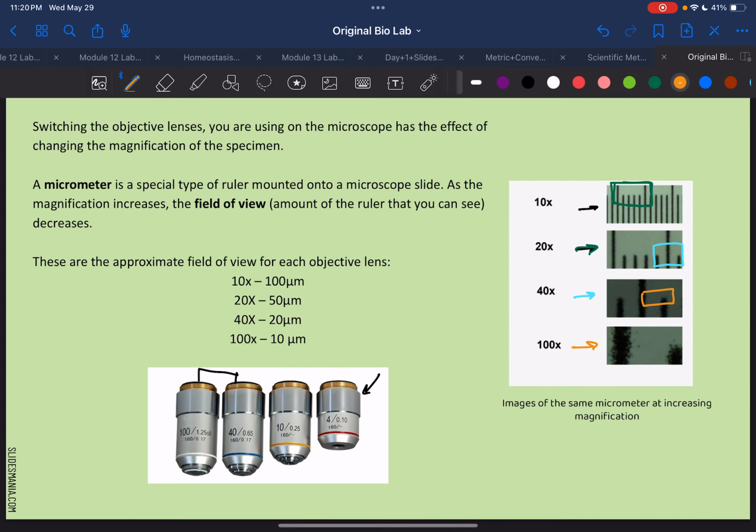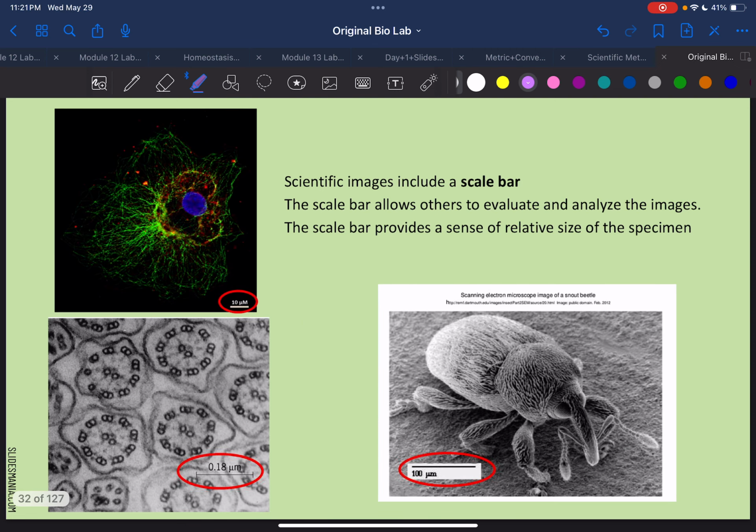Okay. The unit that we're going to be using for this one is micrometer. That is what it's called. A lot of the microscopes that we have in our actual lab classes have a tiny ruler in there, right? Because again, we're trying to measure. So we need a ruler of some sort. Not all of them have that, right? So when it doesn't, we need to find a way to calculate it. So that's going to be the next slide.